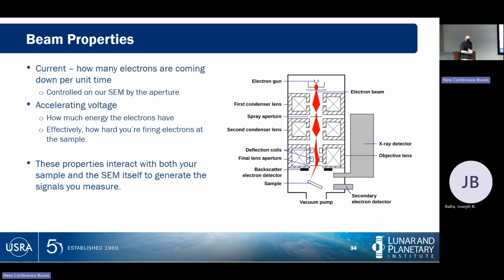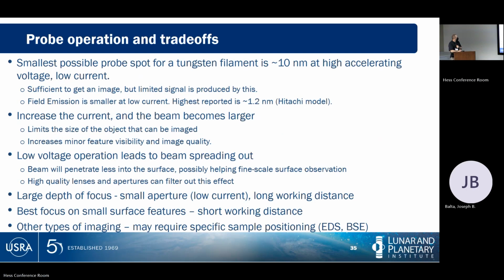These two additional properties are settings that you will get to control on every SEM or electron microprobe that you ever work with. And they affect how the SEM interacts with the sample that you're on, and how it generates images and responses in the sample. All right, whole text slide. Stuff to think through in terms of your settings.